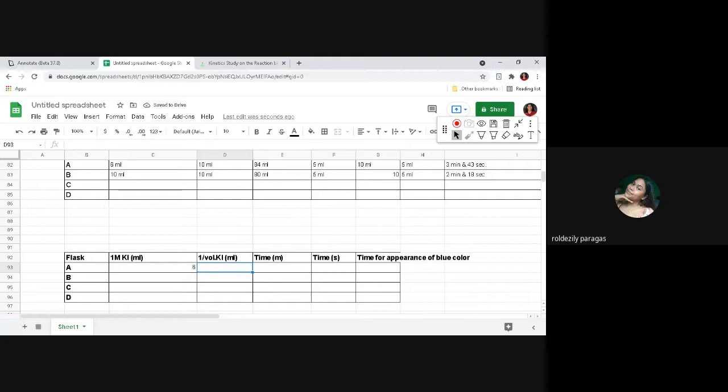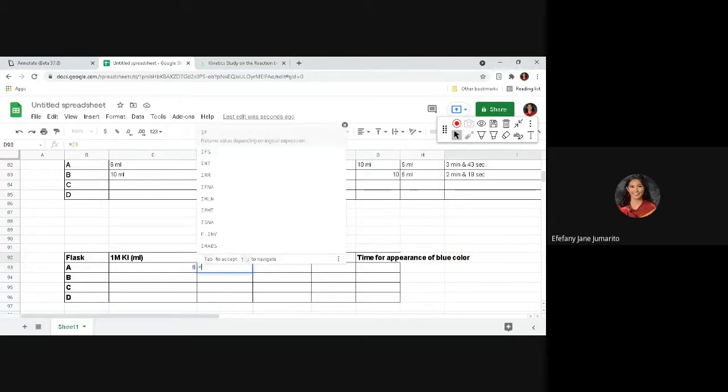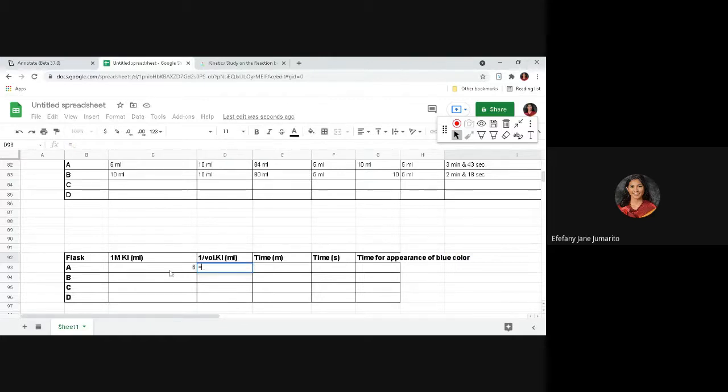So when you write, it's just 0.16. Excel is very nice to use because there's no need for a calculator, you just need to know how to use formulas. So when we do that, if you can't use a calculator, you put equals. Then you put the cell.